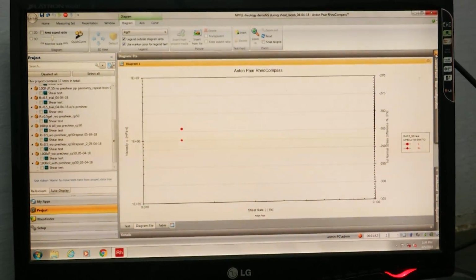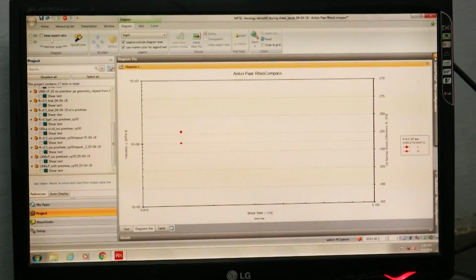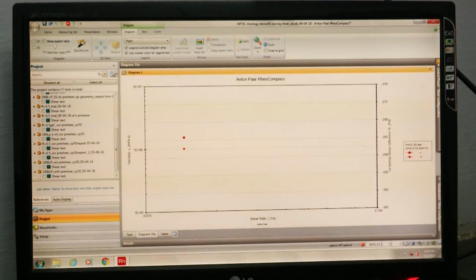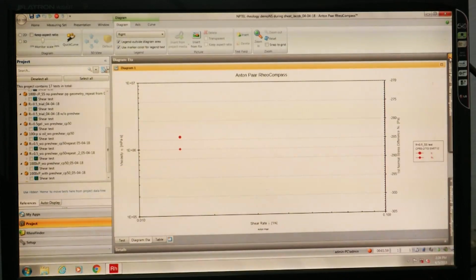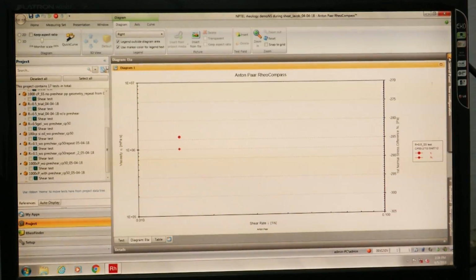One of the important factors to remember while acquiring rheological data is the amount of time that is given to the instrument to collect one particular data point. For example, when we are doing measurements at very low strain rates, it will take some time for the instrument to come to steady state, and therefore a long time may be required.